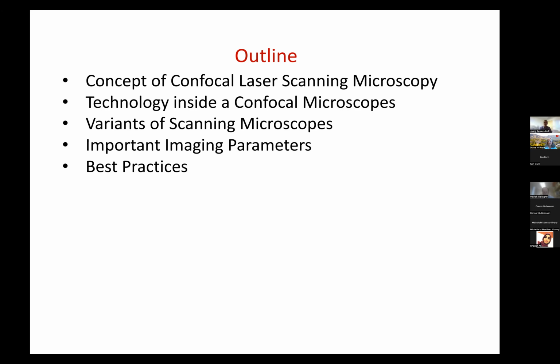So which imaging parameters do you find on your confocal microscope? You can tune these imaging parameters, and it matters a lot how you tune them. So I try to explain a little bit what these imaging parameters actually mean and what you want to optimize them for. And I'll end my presentation today with a few best practices, which is essentially a little bit of a laundry list of things that I want to share, which is by no means complete.